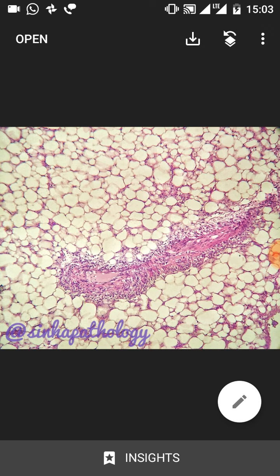I hope this helps you in editing your photographs better. Obviously a mobile app cannot replace Photoshop, which is the gold standard, but I think this is the next best thing. There are many apps available on the Play Store or App Store, so you can download any of them. If you play around with it you get a hang of how to use those apps — they're very useful. Thank you, I hope this video has helped you.